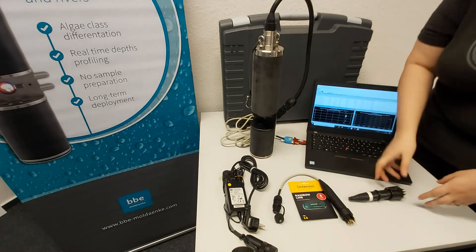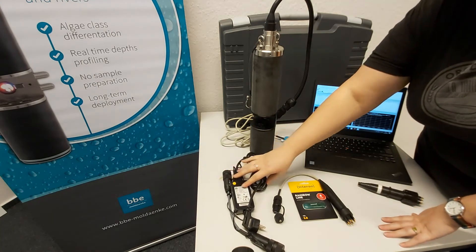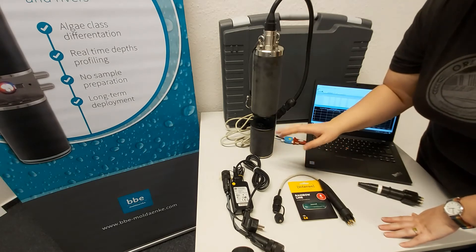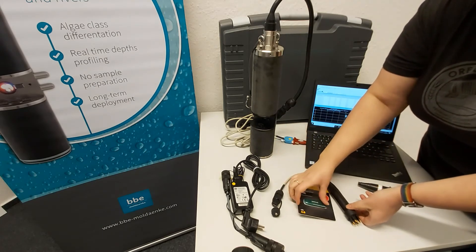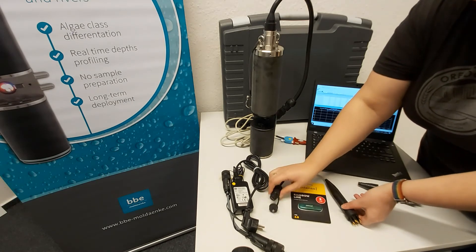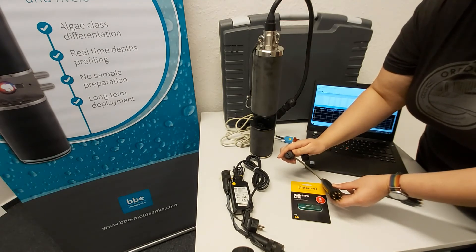In addition to the auto-start plug, there's also a power cable here, which is used to charge the FluoroProbe. We also have this cable here, which can be used with a USB flash drive — also included with the FluoroProbe — in order to download your data directly from the FluoroProbe in the field without the use of a computer.